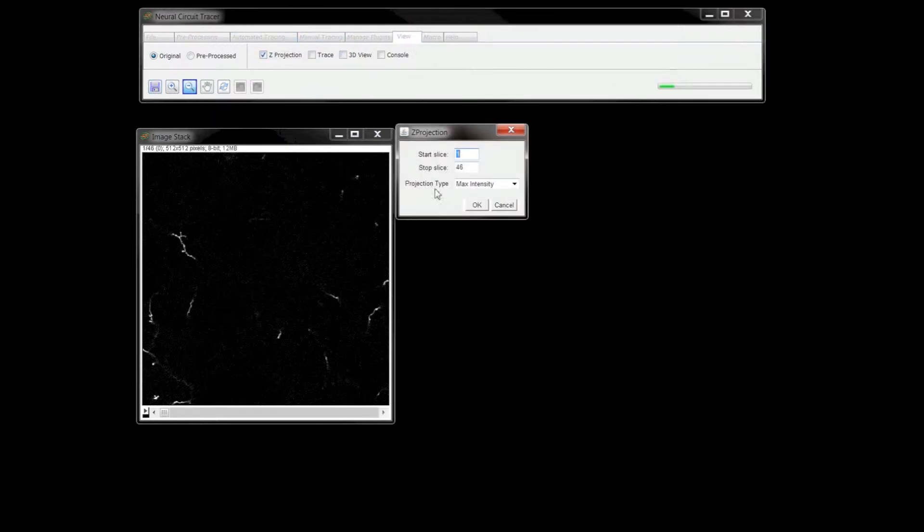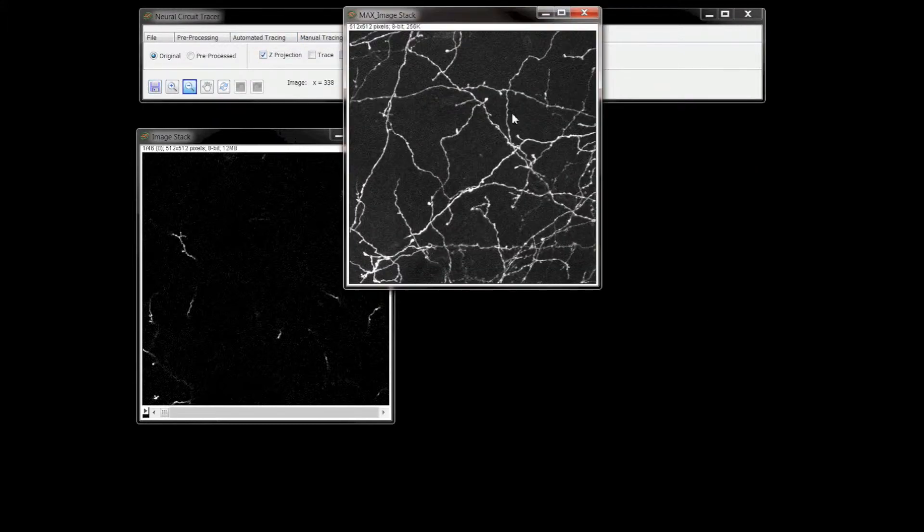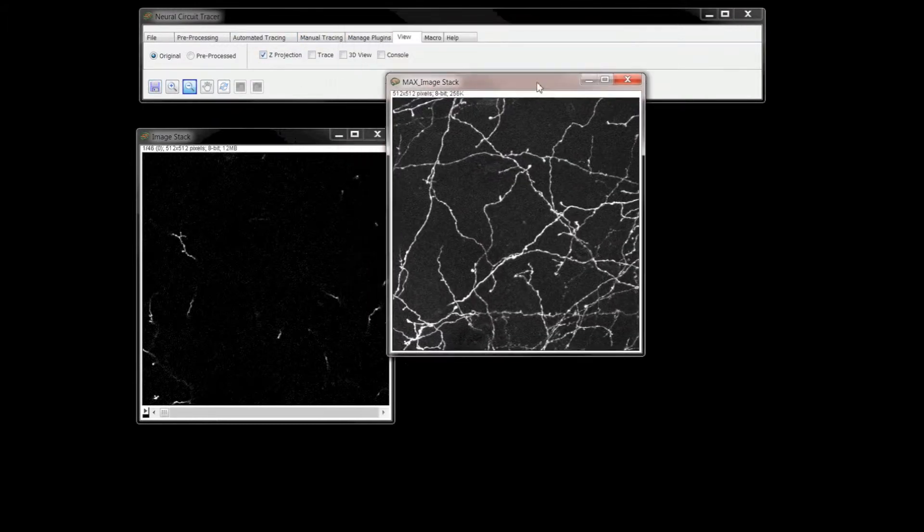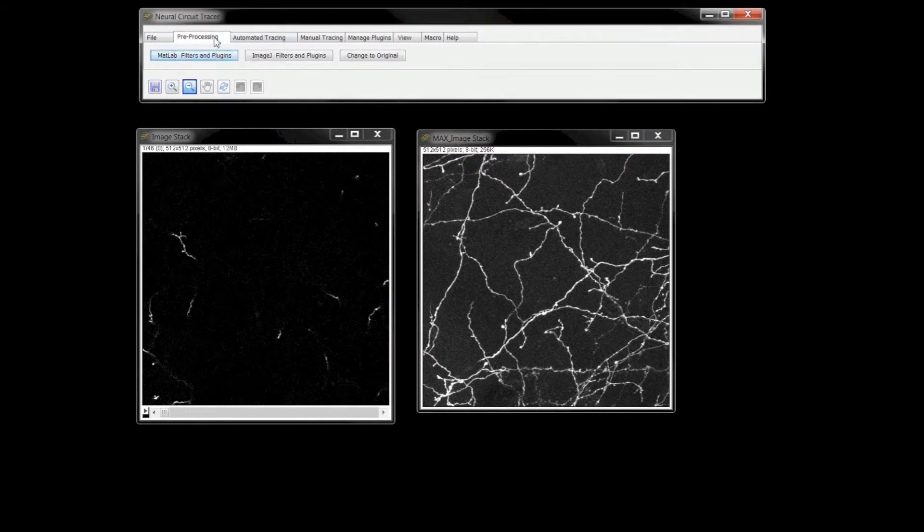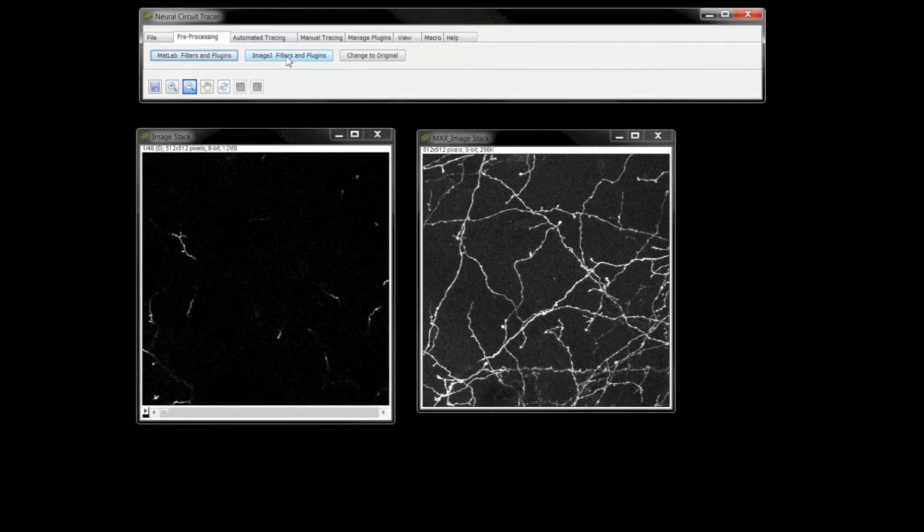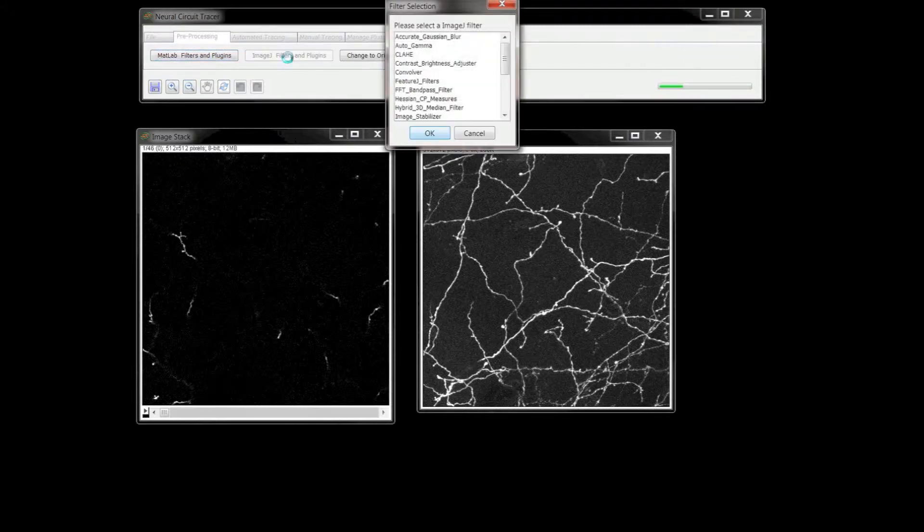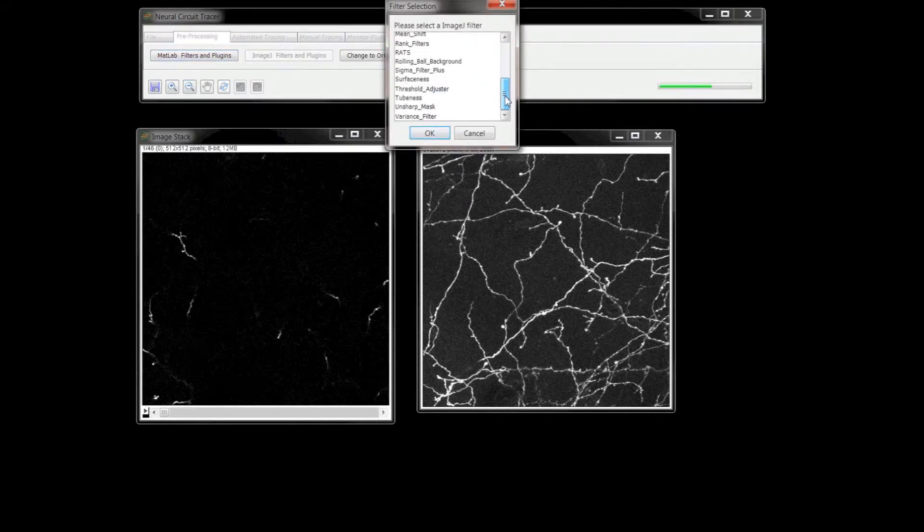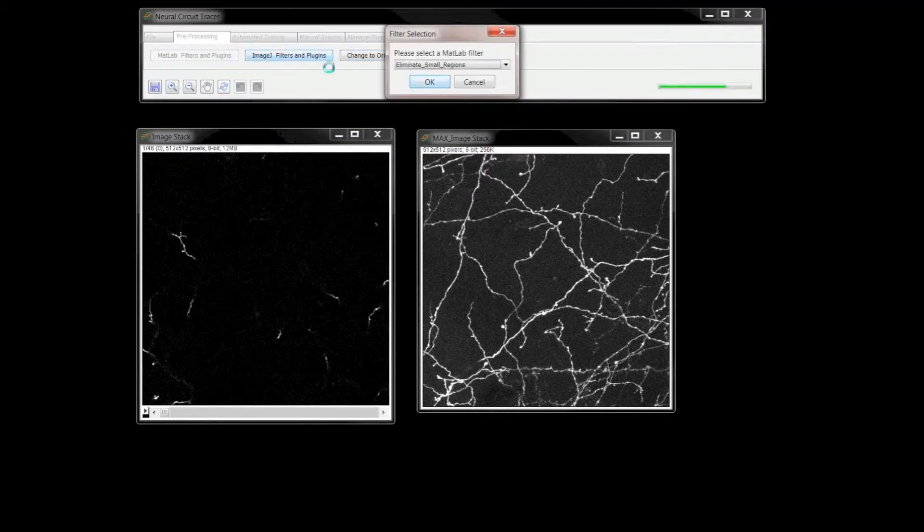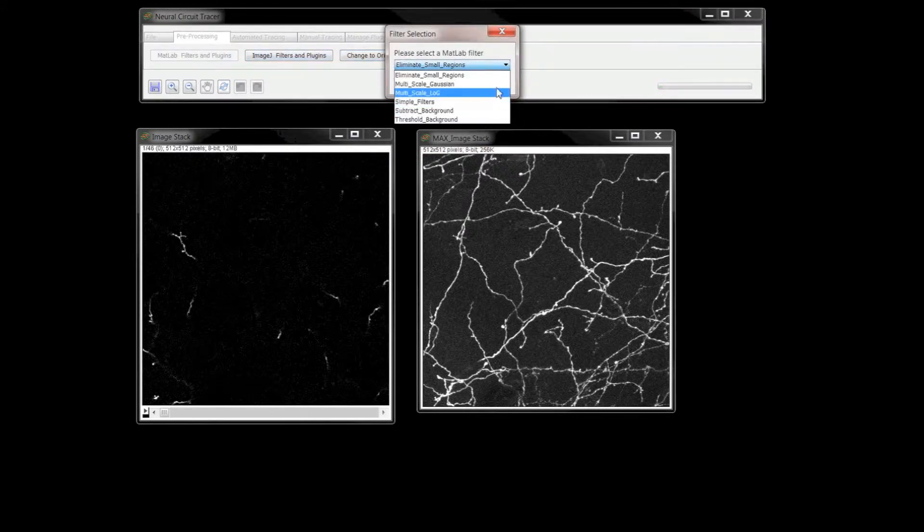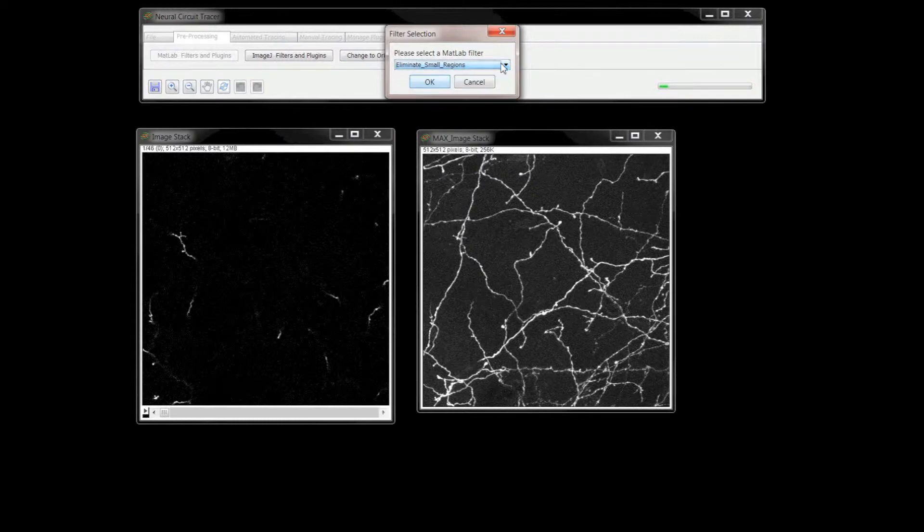The Pre-processing tab allows you to perform many different types of image processing operations on the loaded stack. Along with ImageJ filters and plugins, Neural Circuit Tracer includes custom image processing algorithms written as MATLAB plugins. You can also integrate your own plugins to work with the software.